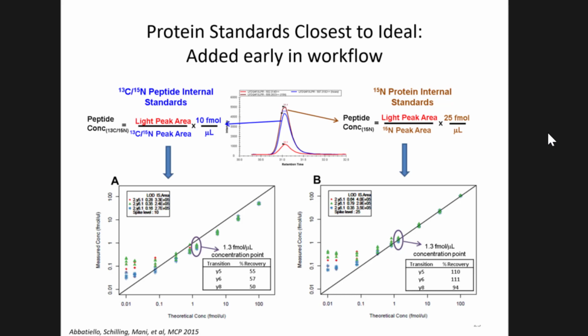Like, if a peptide has 20 amino acids, you might have 5 histidines and 2. You get a low number of each amino acid, so quantifying might not be as rigorous, particularly if it's not fully hydrolyzed. It should be fully hydrolyzed. But in general, amino acid analysis was developed for protein concentration determination, not for peptides. It might have evolved, and there might be ways where it's totally accurate, but I still don't think it's totally accurate.